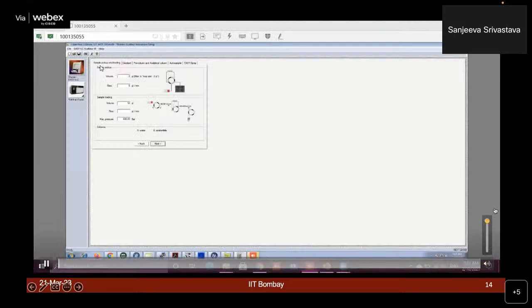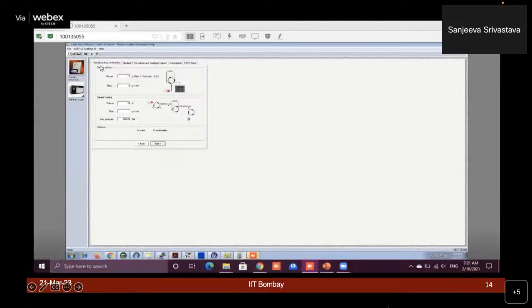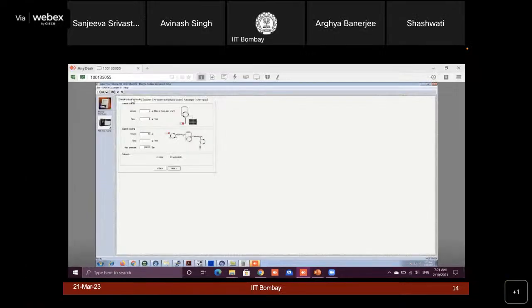Once you have injected the peptide, like you have placed your peptide into the autosampler, the next point is method development. You have to develop a method for your run. We are using the Orbitrap Fusion for our run and the Thermo Nano LC. These are the important parameters which you need to know. First is the sample pickup and loading. Then is the sample loading.